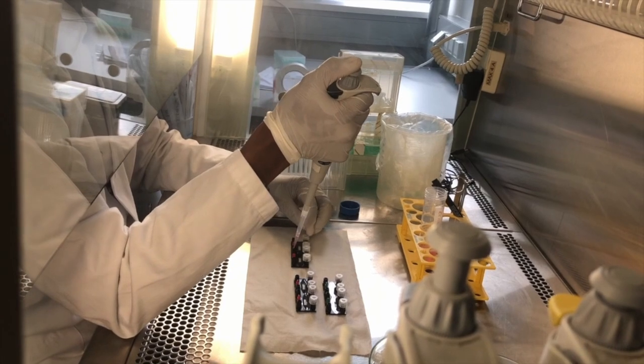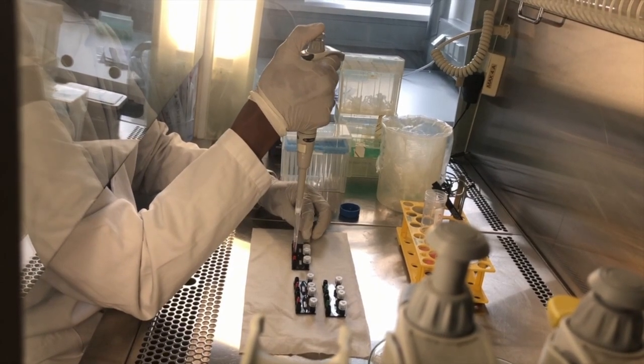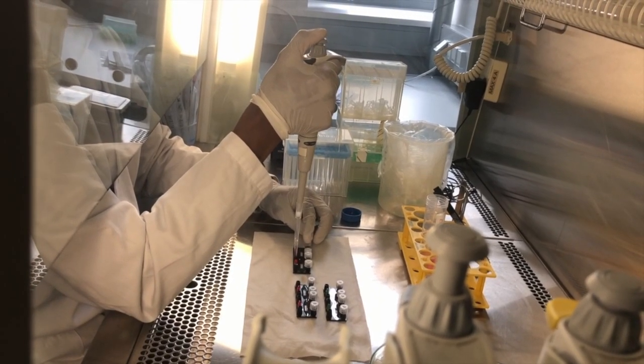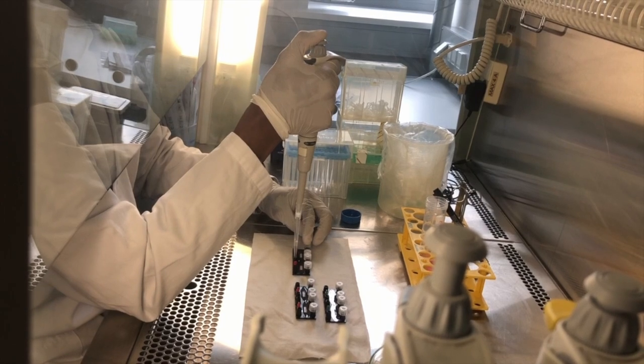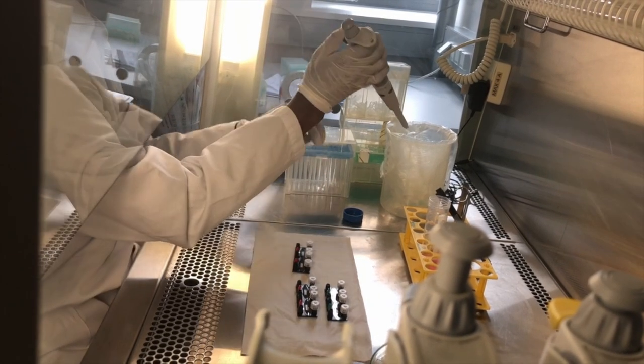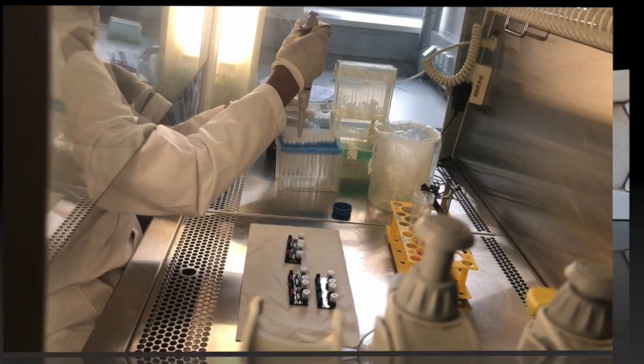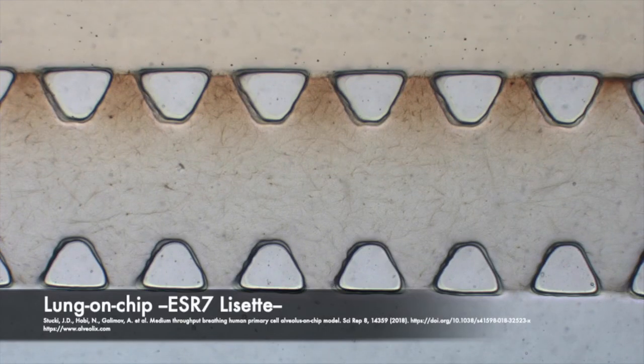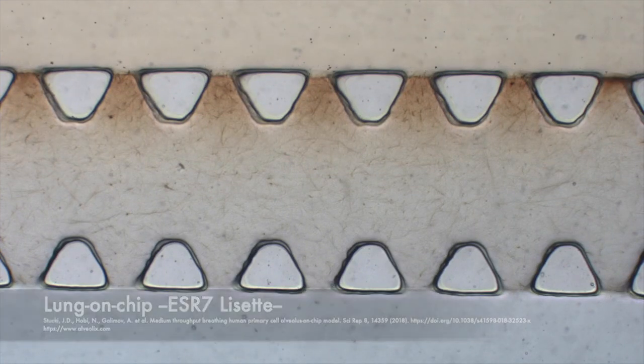Once isolated, the cells can be added into the chip, simply by pipetting. The chip might need to be coated with extracellular matrix before the cells are added, so that they feel more comfortable in this strange new environment. Once the cells are acclimated, they can be perfused with media and kept alive for up to a month.